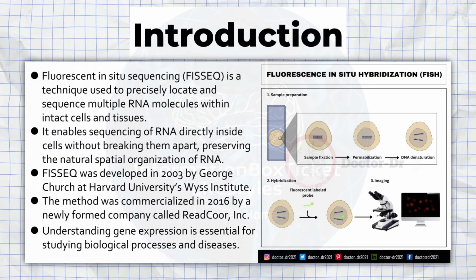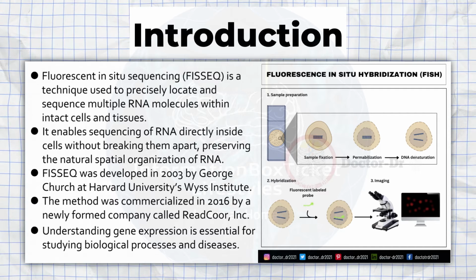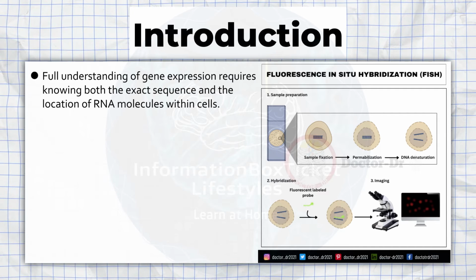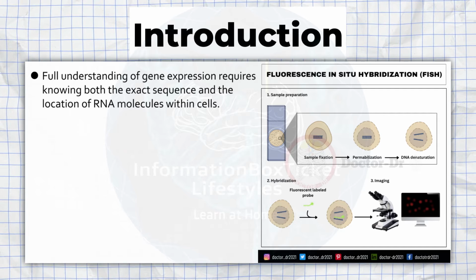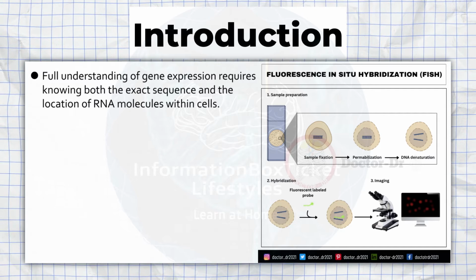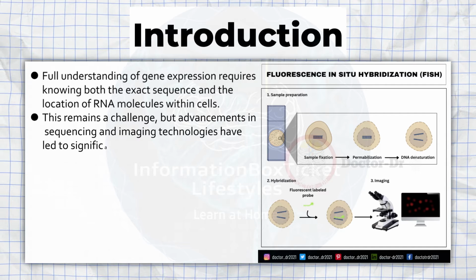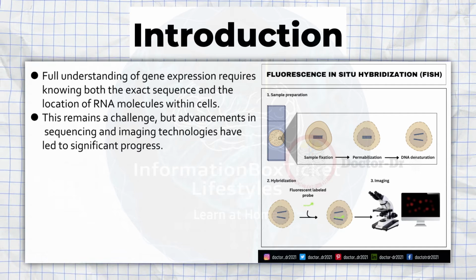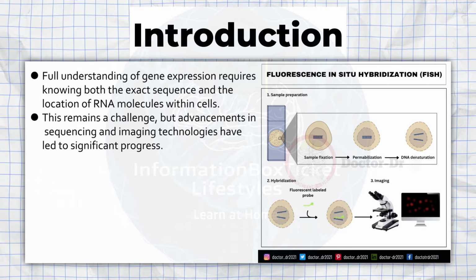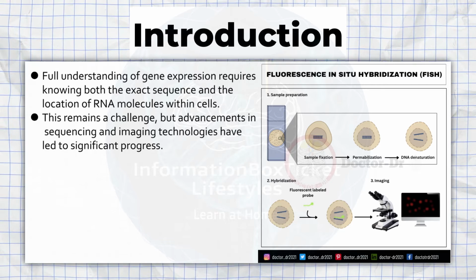Understanding gene expression is essential for studying biological processes and diseases. Full understanding of gene expression requires knowing both the exact sequence and the location of RNA molecules within cells. This remains a challenge, but advancements in sequencing and imaging technologies have led to significant progress.